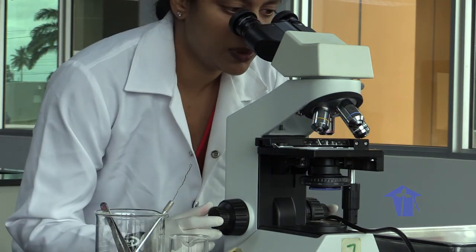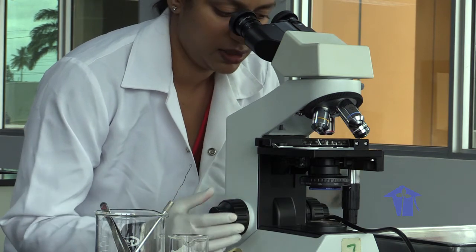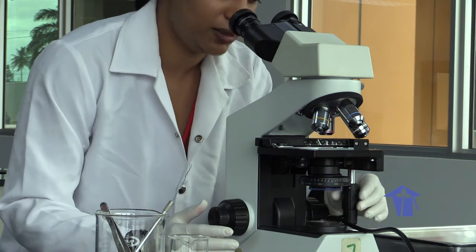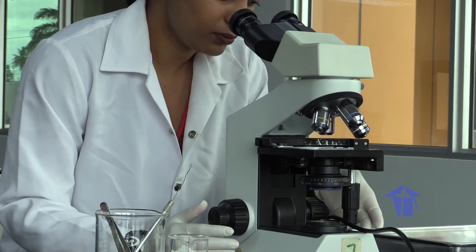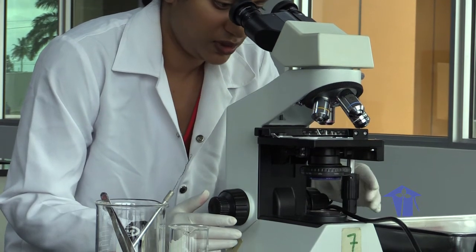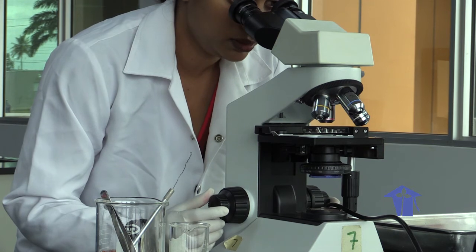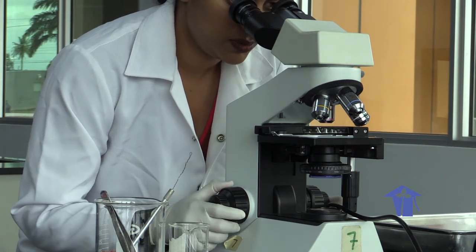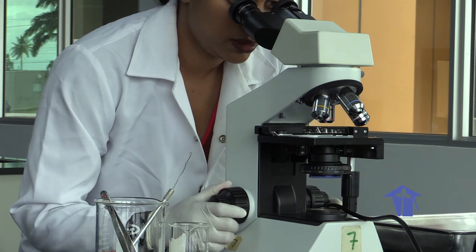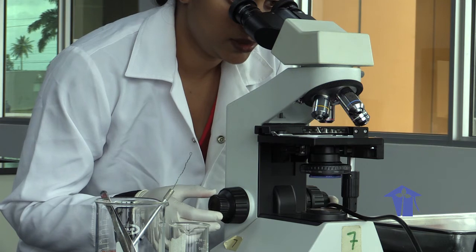We're going to make sure we get a clear image by using our fine and coarse tuning knobs, as well as shifting our stage right or left to center it on our stage so that we can see our sample. We use our coarse tuning knob to get it into range, and then we move to our fine tuning to get a clear image.